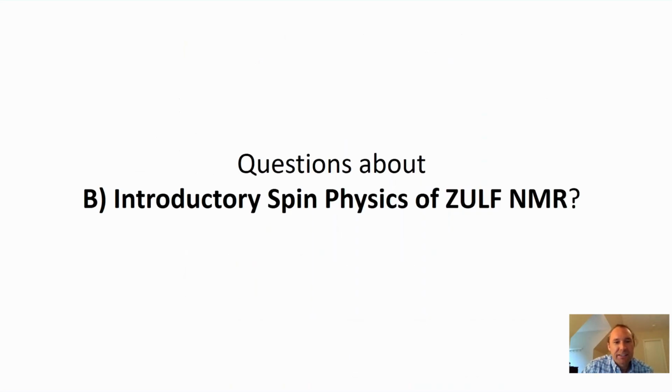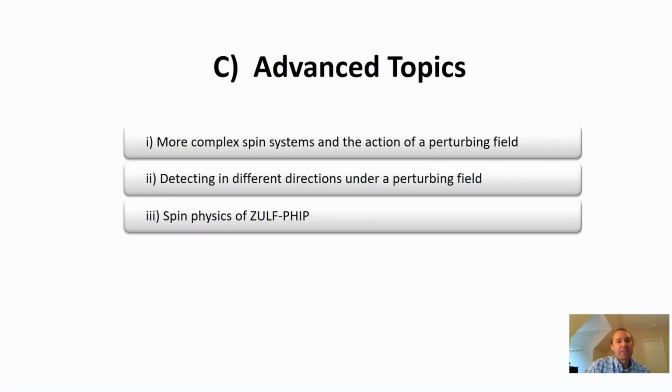Good, okay, so then I'm going to stop here and move towards the more advanced topics. In these more advanced topics, I want to briefly show some examples of perturbing fields and possibilities of analyzing them, only to give you an impression.